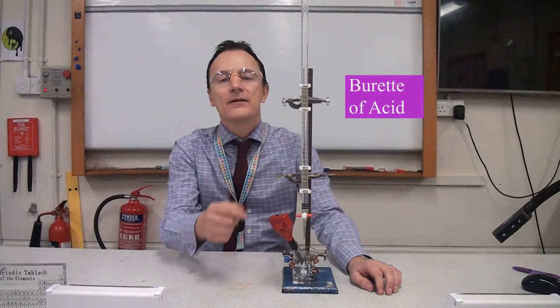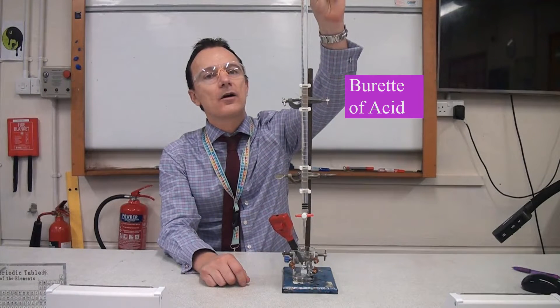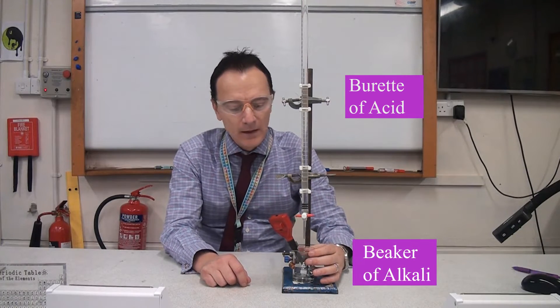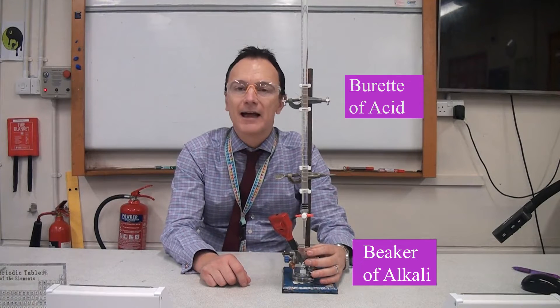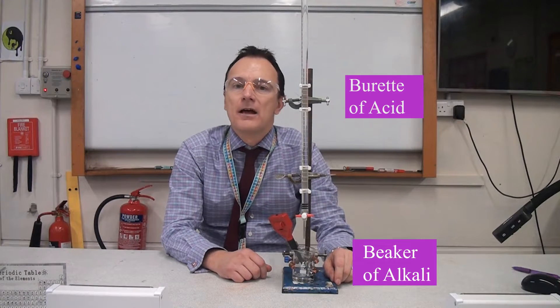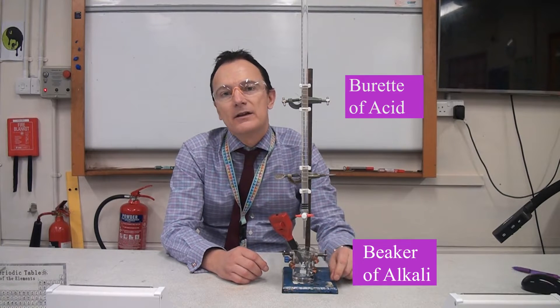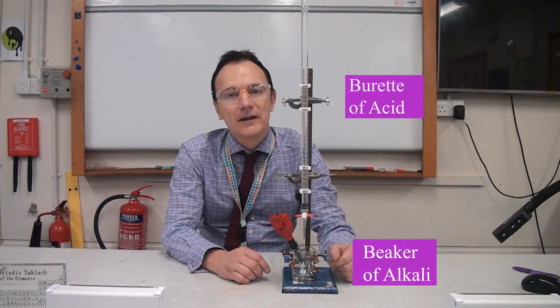So let me talk you through what we've got here. I've got a burette filled with hydrochloric acid, filled to exactly the zero mark at the top, and it measures all the way down to 50cm³. At the bottom I've got a small beaker with some alkali in — sodium hydroxide. Now I could look at the pH using universal indicator, but that would only give me a measurement to the nearest whole number, so it would probably go purple and tell me it's pH 13.